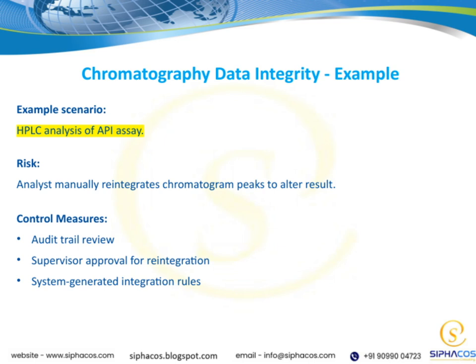Additionally, the system uses predefined, system-generated integration rules, ensuring that peak integrations are consistent and not arbitrarily adjusted. All these measures work together to safeguard the accuracy and integrity of our chromatography data, fitting into our overall theme of maintaining high standards in analytical process control.